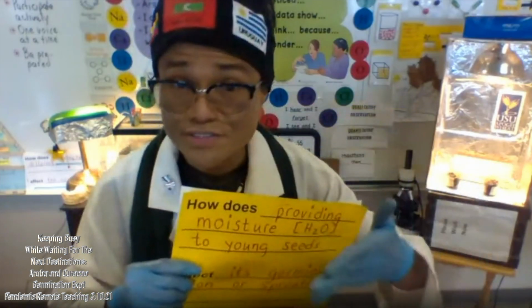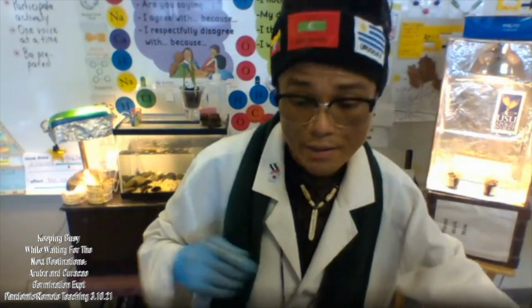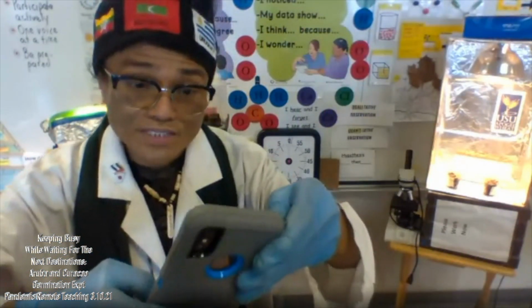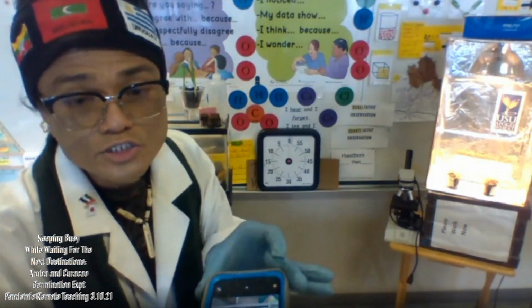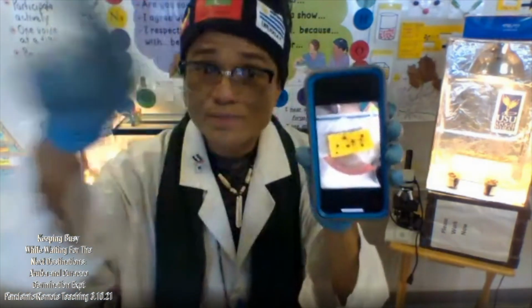But this time we are setting it up, and I do expect that you will take some time to set up your own. And you want to make certain that you take a photo of every single step of the way. So that's why I'm going to take some time to take a photo of this setup. This is day one. And the good thing, your Chromebook takes pictures as well. If you have a regular camera, just like what I have, take a shot, which I did. And this goes to the website that you are currently working on.